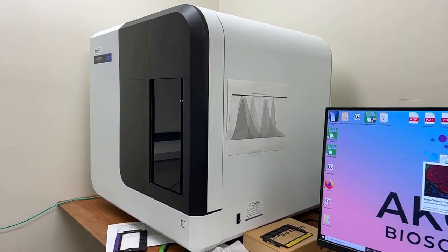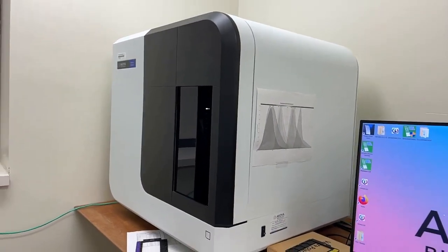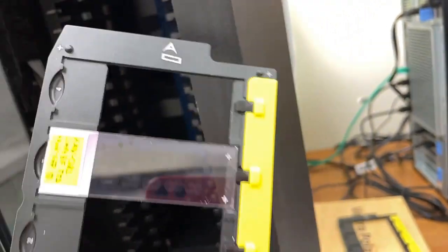There it is. Behold! And you could put a lot of slides in there. Currently, I just have one slide in there because that's the one that I want to scan, but it has many sections if those play at all. So ideally, they would all come through.